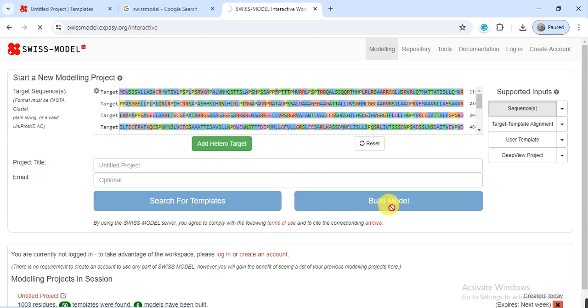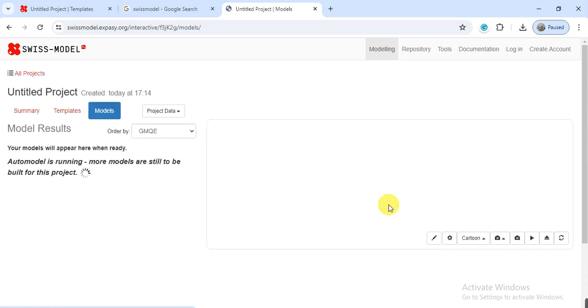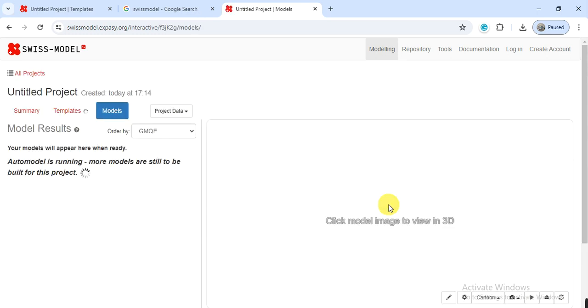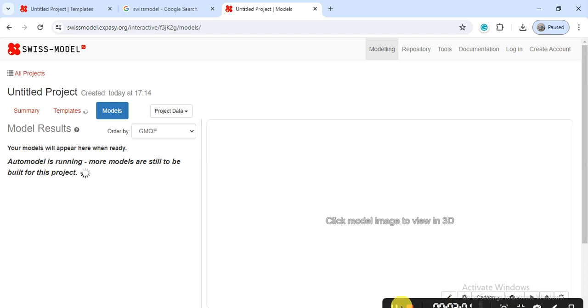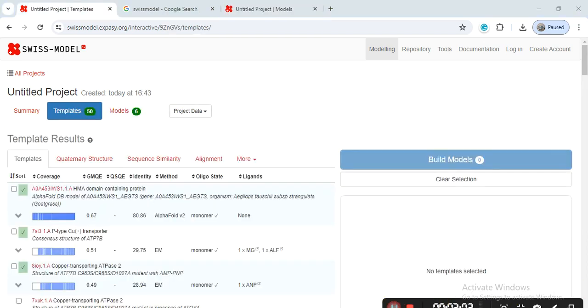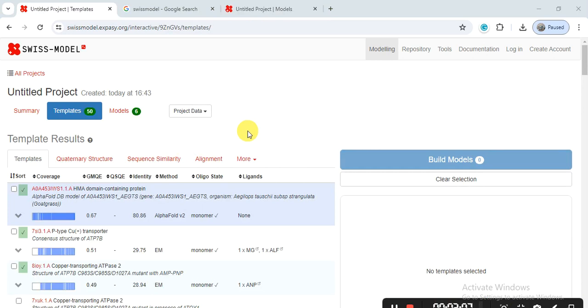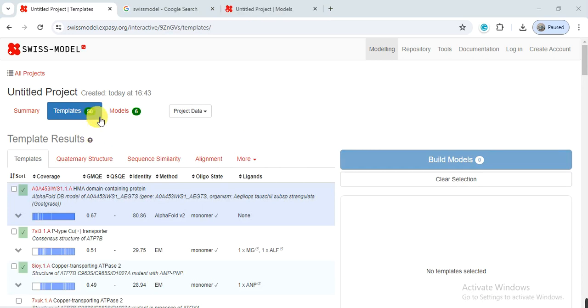When you click on model, it will start working on it, so it will take time, so just wait how much it takes time. Here are the results of our protein sequence. On the basis of our protein sequence, it have made about 50 models.